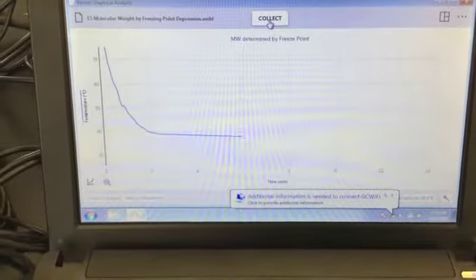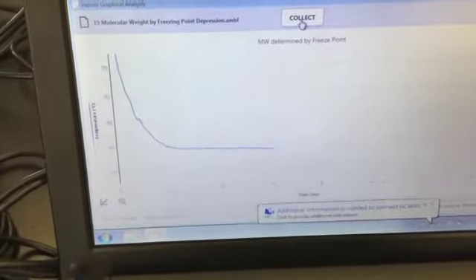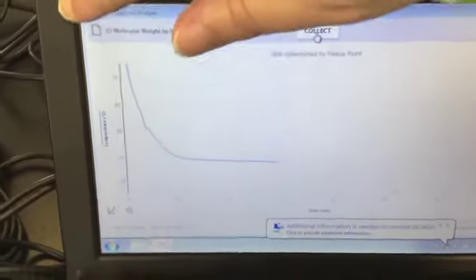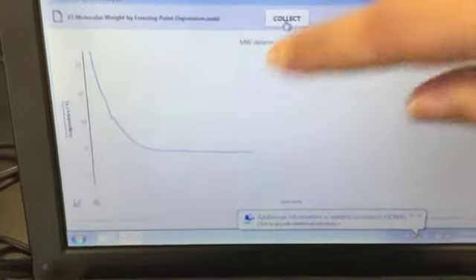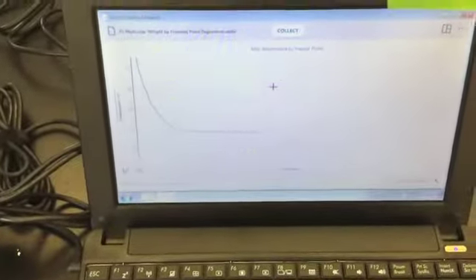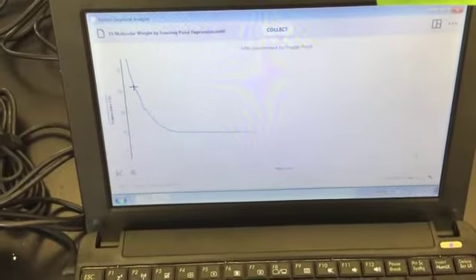Now it's time to use our data to find the melting point of the mixture. So what we have here is a cooling curve with a slanted region where we had a liquid and a flatter region where we were forming the solid. We are going to form two tangent lines to these areas by highlighting the straightest portion of the graph.